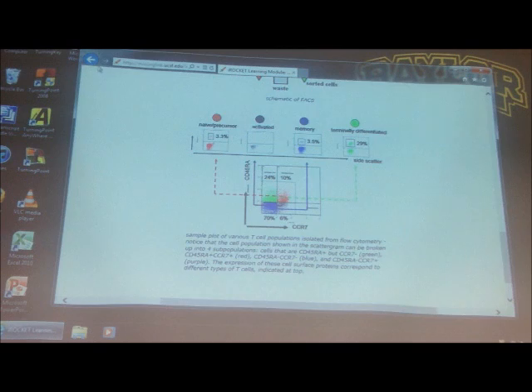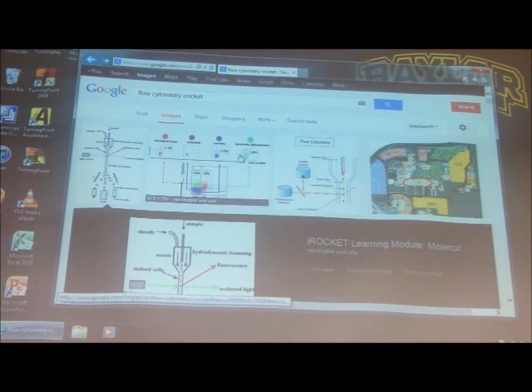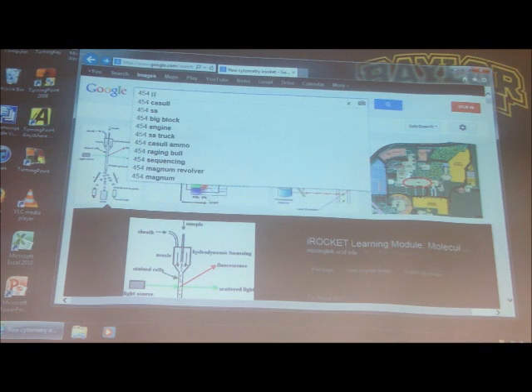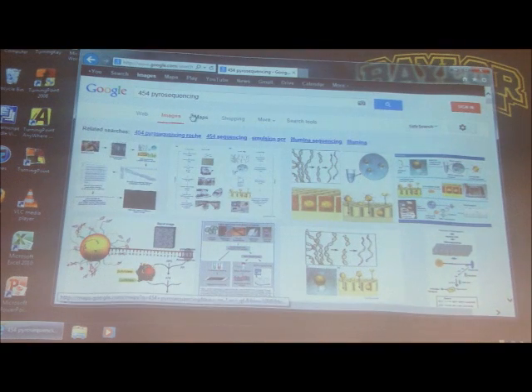Let's move on to next generation sequencing. And for that, we're going to start off with, I presume you already know Sanger sequencing, so I'm not going to go over it. So we're just going to do next generation sequencing, 454 pyrosequencing. And that has been bought up by Roche. And so let's go ahead and see how that is done.